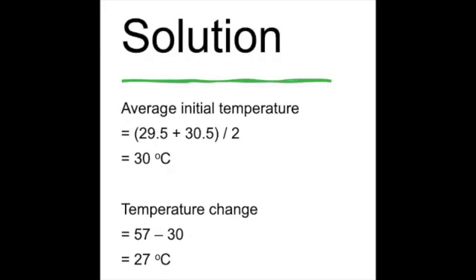Next, we shall calculate the average initial temperature for both acid and alkali before we proceed to calculate the temperature change, which is the data. The data that we can obtain here is 27 degrees Celsius.